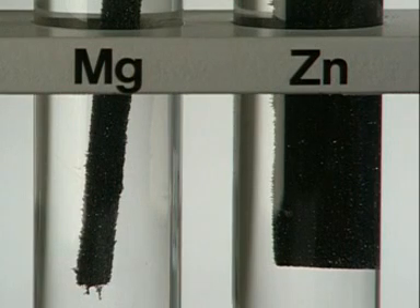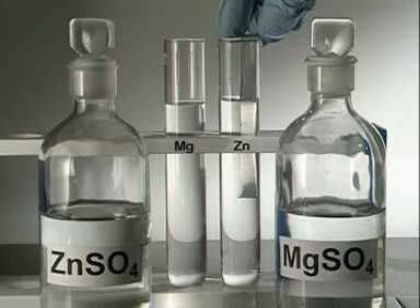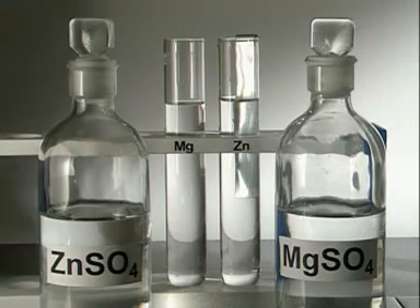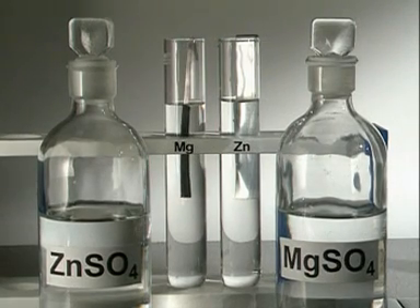Magnesium and zinc are displacing the lead from solution. Placing zinc metal in a magnesium solution and magnesium in a zinc solution will help determine which of these two is more reactive.